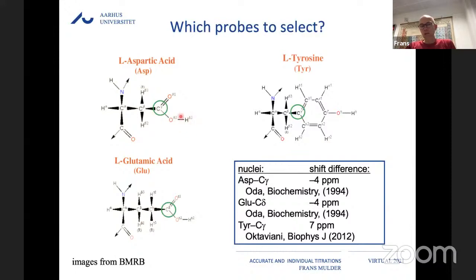So sometimes one can use isotope shifts by replacing hydrogen with deuterium, and that way the carbon chemical shift will change, and this is a way that you can detect that it's actually there. That's one thing that makes it challenging without a titration to see whether something is protonated or not. But I guess isotope shifts are probably then the best way.